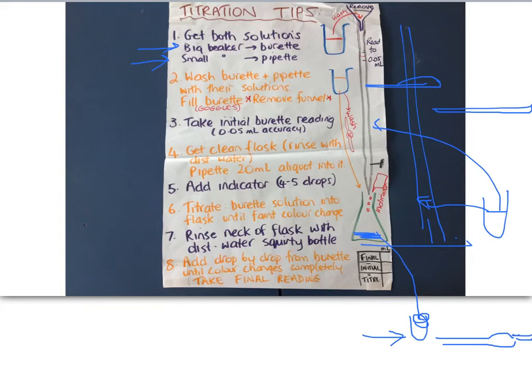Then you're going to fill up your burette with your big beaker. And always remember to remove the funnel when you've finished doing that, because later after you've started your titration there could be drips that fall out of your funnel and change your results. So you need to remove that funnel.